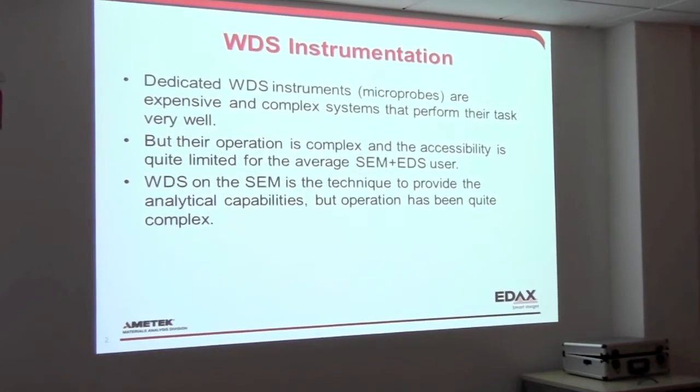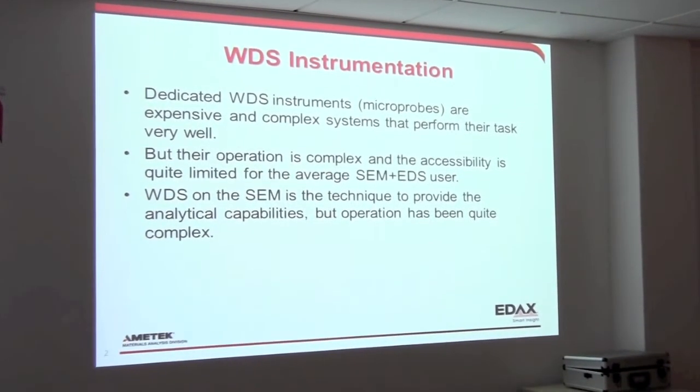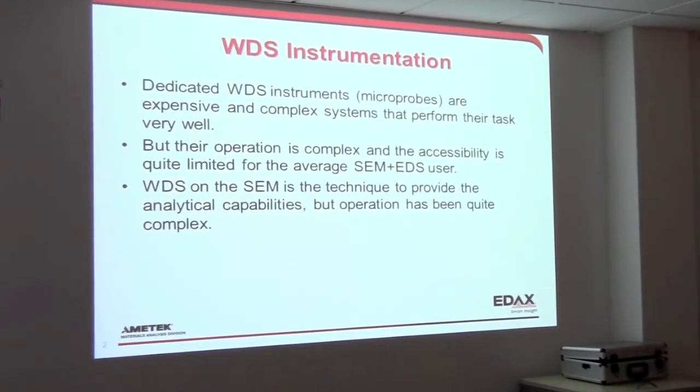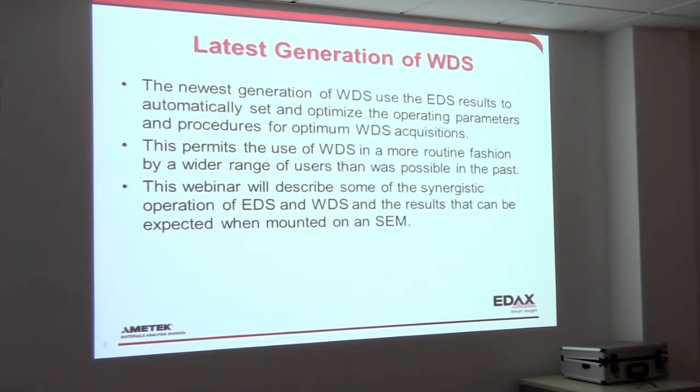So WDS on the SEM, as we saw in some earlier pictures in the earlier presentations, is a technique that we want to provide to users to get the capabilities that we need, whether it's mapping capabilities or quantification or something along those lines. So we do want to do the WDS. We like it on the SEM because there are many, many labs with SEMs, but we would like to try to get some of the capabilities of the more infrequent dedicated WDS systems.